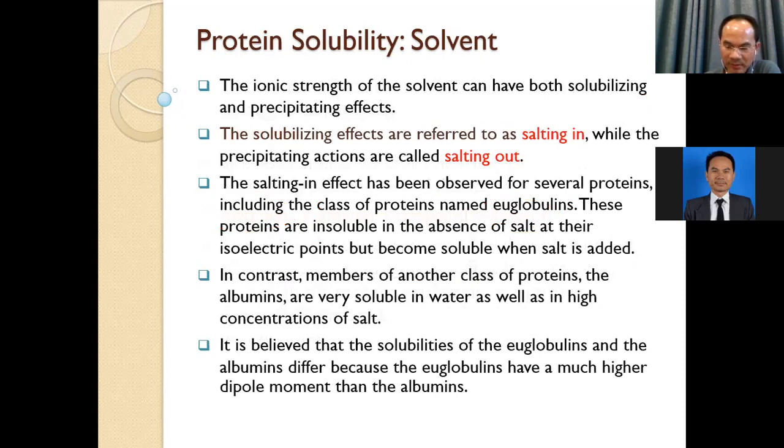And also we separate the solvent effects on protein solubility into salting in and salting out. We can add the salt to the solvent. Salting in means you add the salt, and as you add the salt, solubility increases with the salt. Salting out means solubility decreases with the salt.